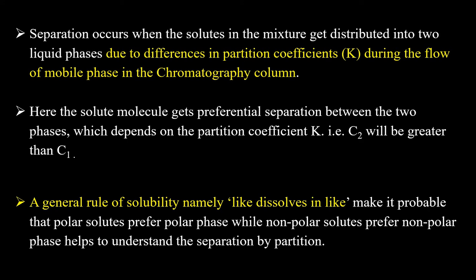A general rule of solubility, namely like dissolves in like, means that solutes dissolved in the organic solvent are different from those in the aqueous phase.